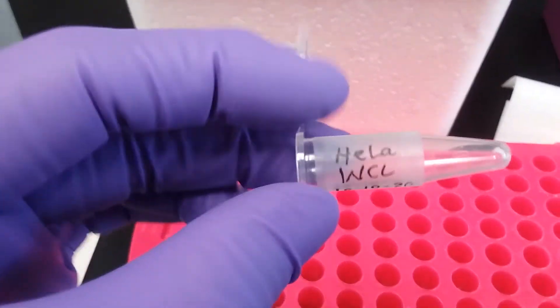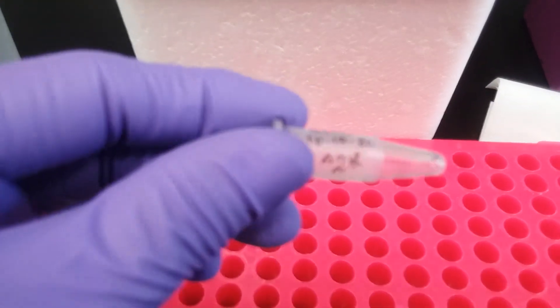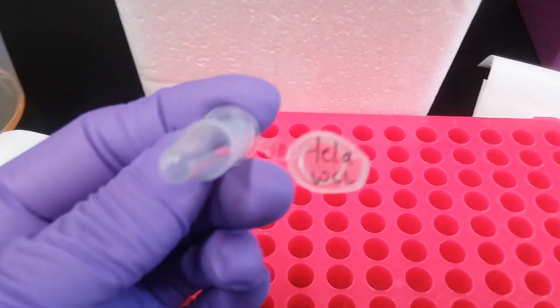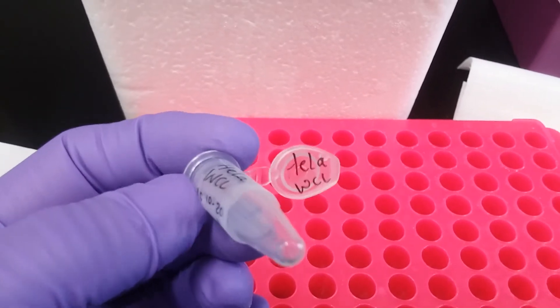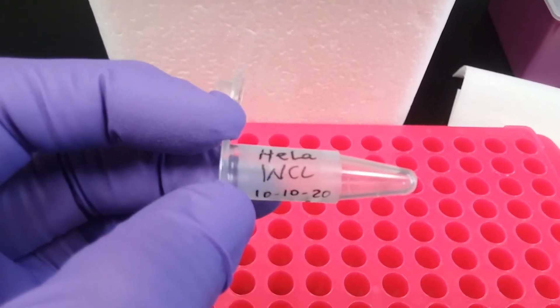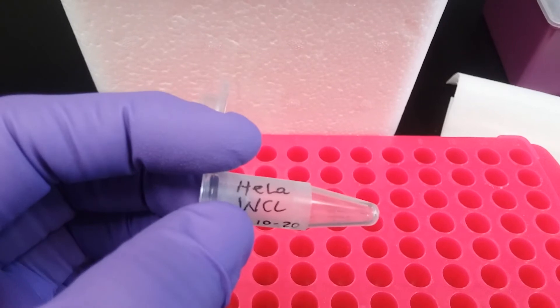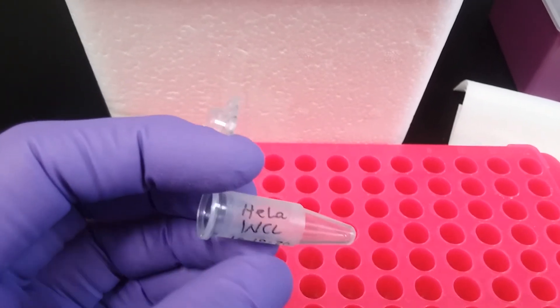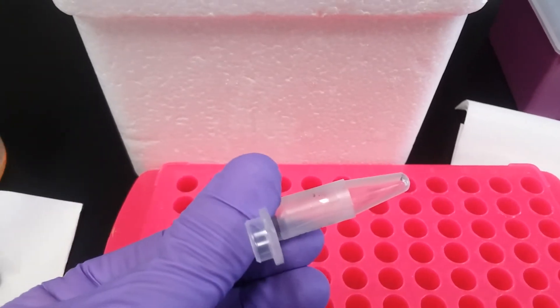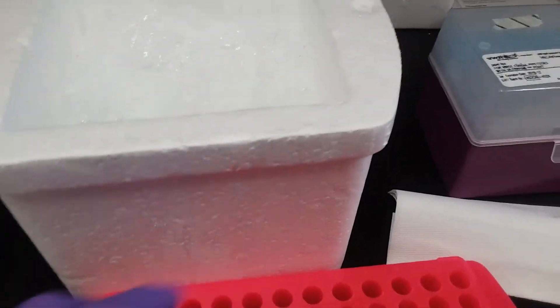In the meantime, I've labeled myself an archived labeled tube. It says HeLa whole cell lysate, the date and my initials. I actually labeled the top as well so I can find it quickly. A little tip is that there's Triton in this whole cell lysate so you can easily wipe off your label. So I just use a little bit of scotch tape to keep that label in place. Pretty simple.